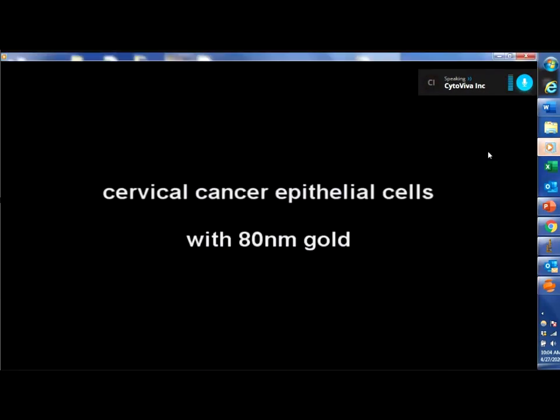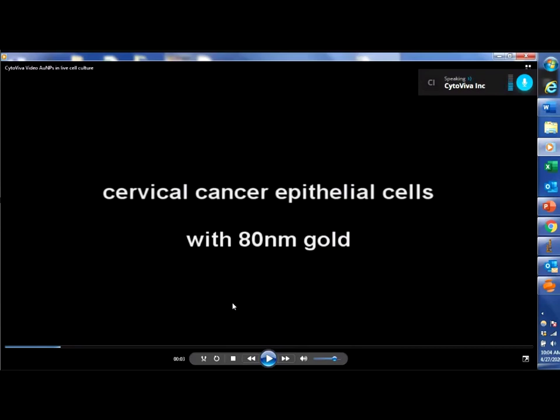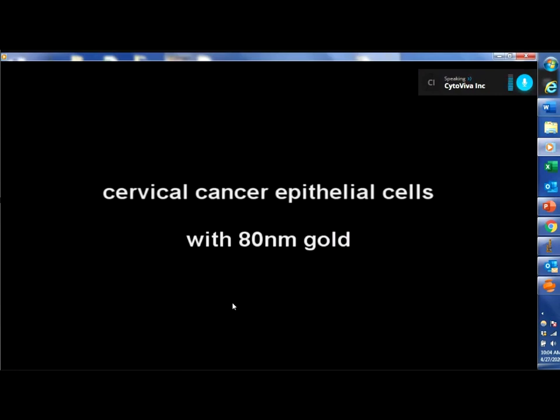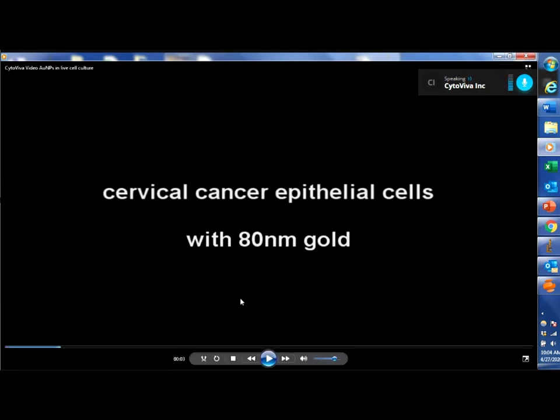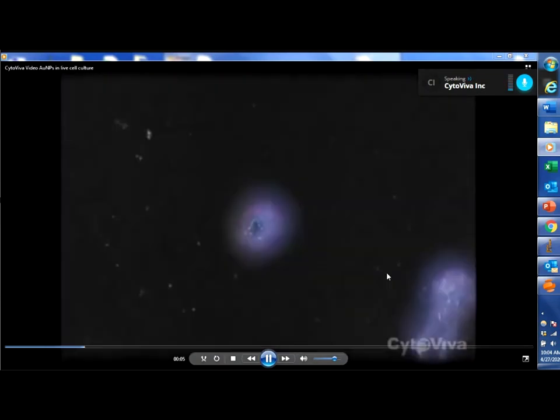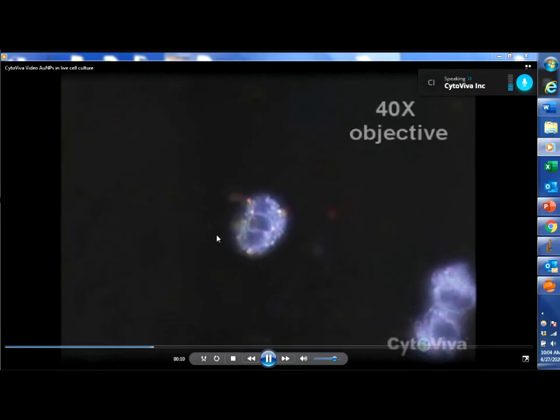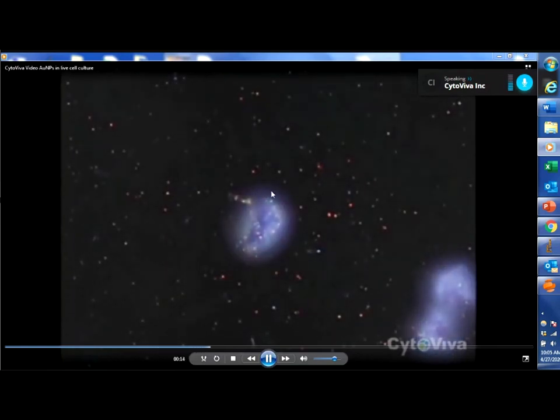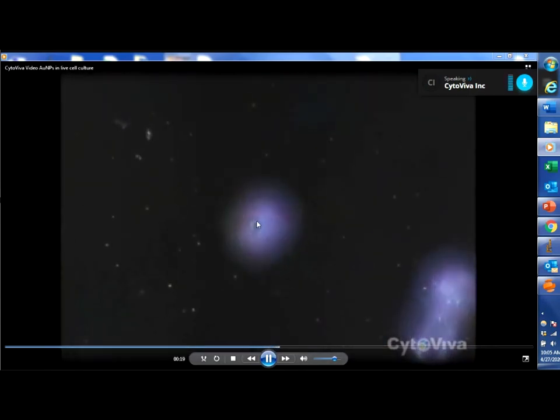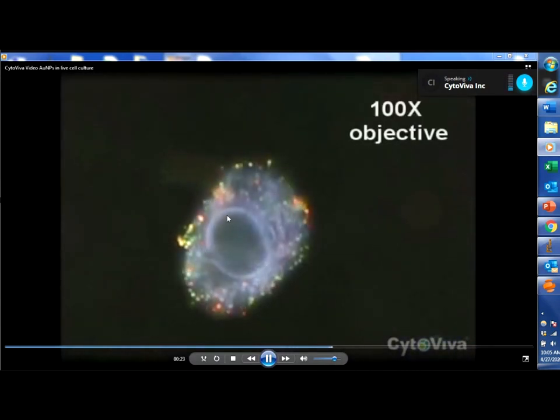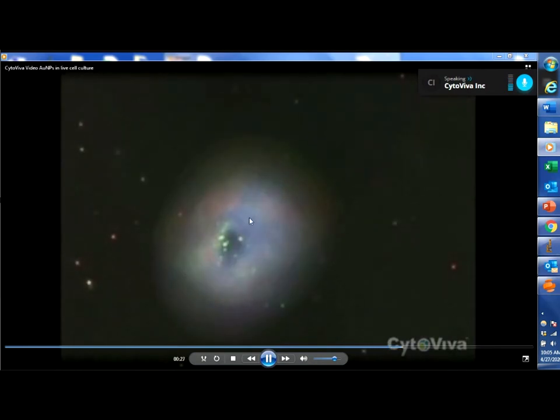I want to take you through a video that basically shows what you typically see with our microscope. For those of you that already have our technology, you know that our darkfield optics are really the core of the whole system. In addition to selling just the darkfield optics, we also have a hyperspectral imaging system. This video shows cervical cancer epithelial cells with 80-nanometer gold particles — this is what you typically see under the microscope at 40x. The video sections back and forth, up and down from the top to the bottom of the cell through different focal planes. Here it is at 100x — you see the nucleus in the center, the membrane, and particles some of which you can see moving around, perhaps inside a vacuole or trapped between the membrane and the nucleus.